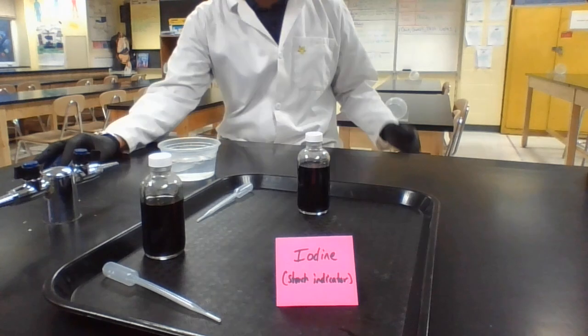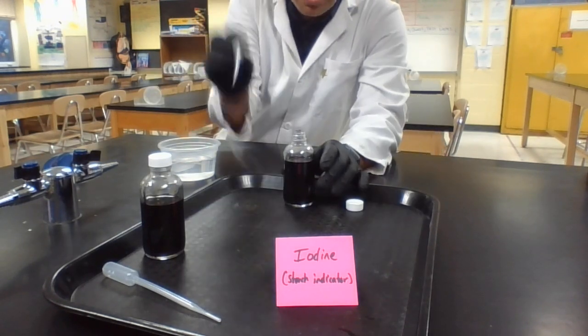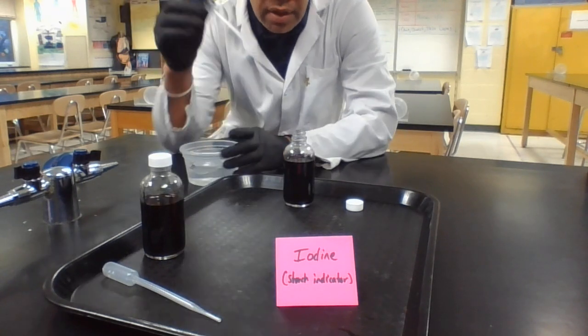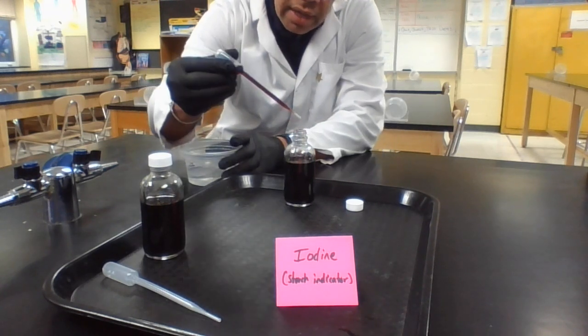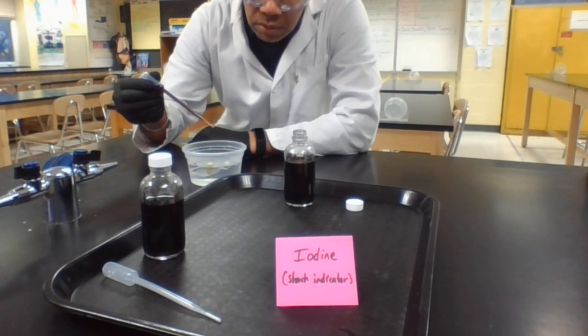I'll be right back. Okay, I am back. Sorry. So you have these pipettes. Again, stay here with the iodine. We don't want to cross-contaminate them with anything else. So I'm going to draw up as much as I can, and then on a count. 1, 2, 3, 4, 5.